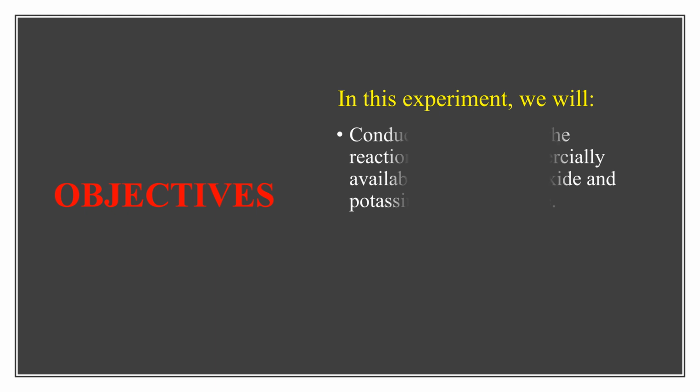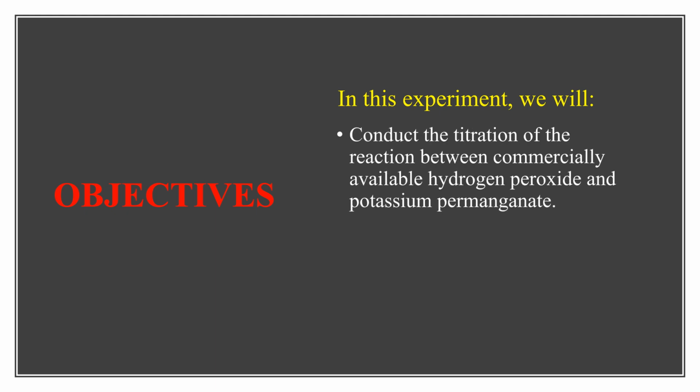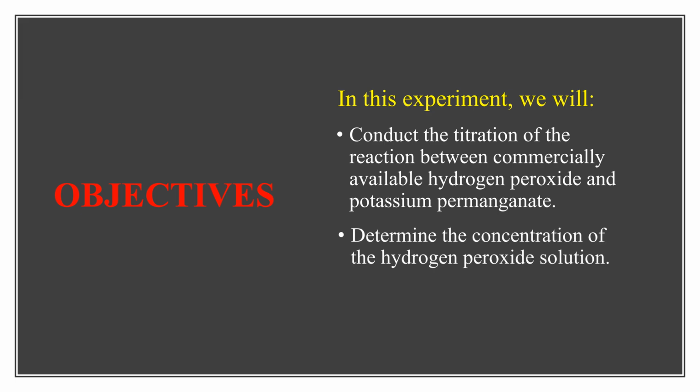I'm going to explain how to conduct a titration process of the reaction between commercially available hydrogen peroxide and potassium permanganate. Then determine the concentration of the hydrogen peroxide solution.